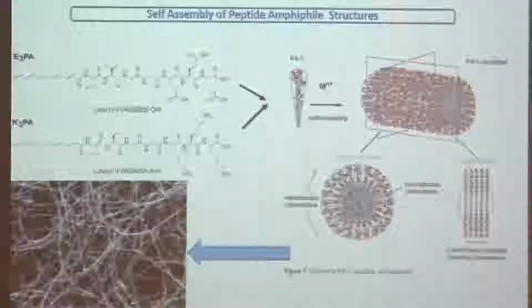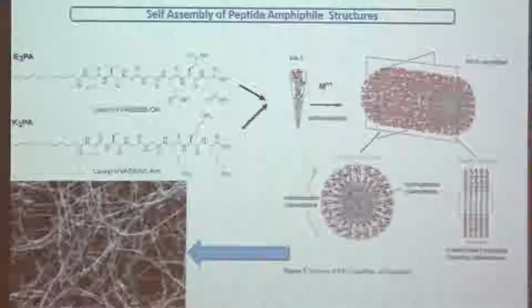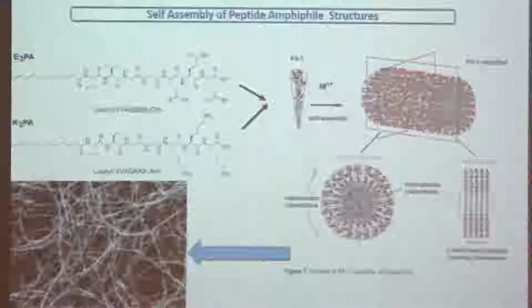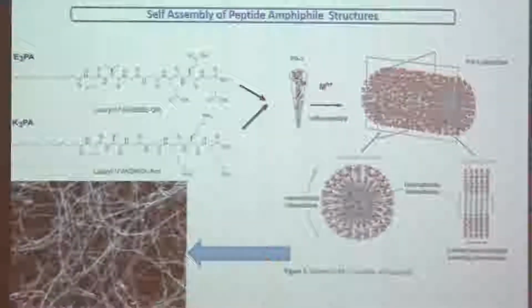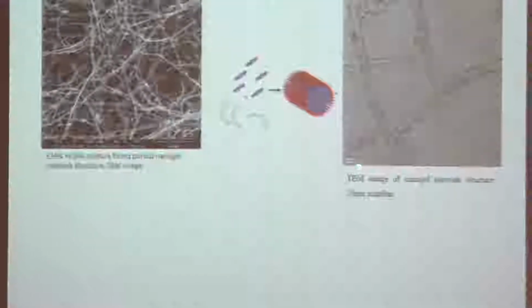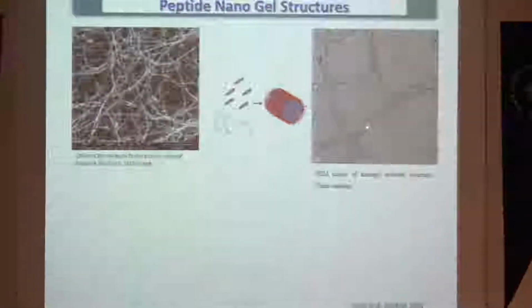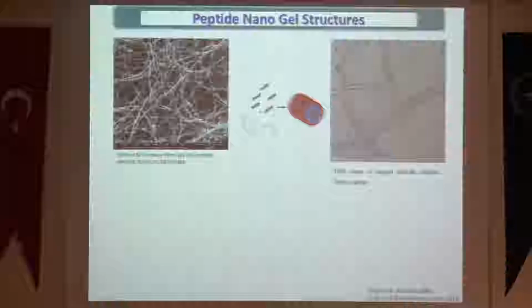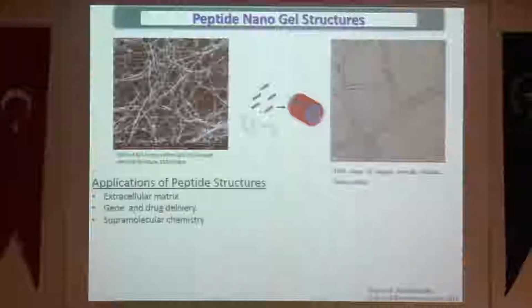Next, the SEM picture of a gel like this. Again, this is a physical gel. There's no chemically cross-linked part of this. And this scale bar here is 1 micron. And again, this was an SEM picture, and then there's this TEM picture. This scale bar here is roughly 20 nanometers, and the 20 nanometers corresponds to the thickness of the single fiber.